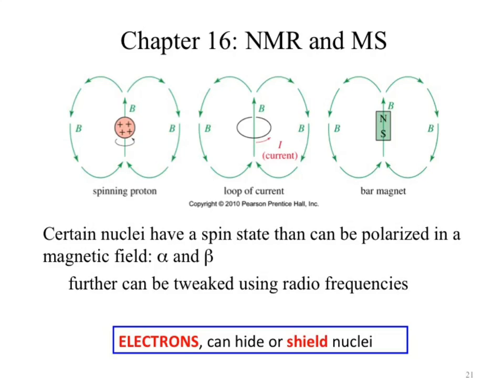So what we've just pretty much discussed is the four main aspects of hydrogen NMR. You get how many signals you end up seeing, you get a chemical shift, you get an integration, and you get a splitting pattern or multiplicity. So when we break down evaluating spectra, that's what you're looking at. One of those four things, which you should be kind of happy about.